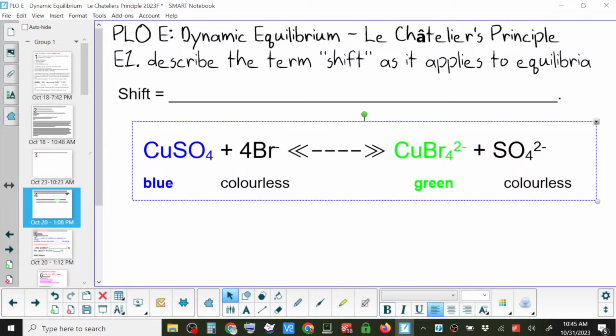That's a different blue. Yes, different blue. It's dissolved properly. Pardon? It's not all dissolving. Maybe I read it wrong. I was supposed to add 50, but I added 5. So who knows? But it definitely shifted the equilibrium. It's a much lighter blue. Maybe you should add 5 to the 1.